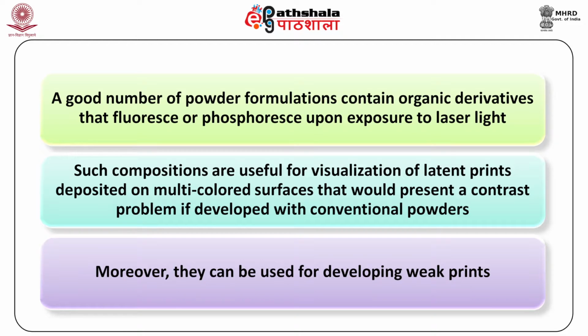Such compositions are useful for visualization of latent prints deposited on multicolored surfaces that would present a contrast problem if developed with conventional powders. Moreover, they can be used for developing weak prints.